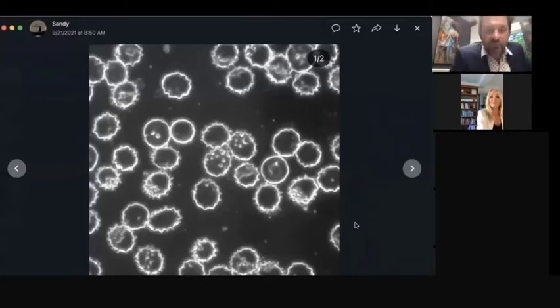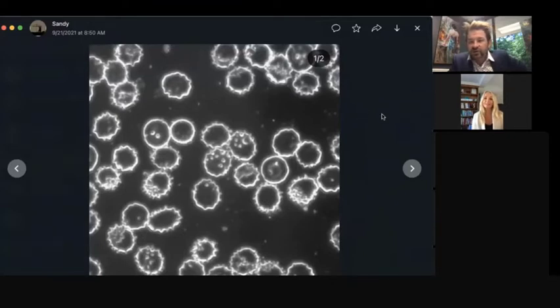So I pulled up some slides real quick. I basically pulled up the photos that you sent over and some of the videos. So we'll look at these. I think you can see this. These were some of the images you sent over, and we'll walk through what some of these images and videos mean, the interpretation and such. So the first one, this was from someone who has been injected, correct?